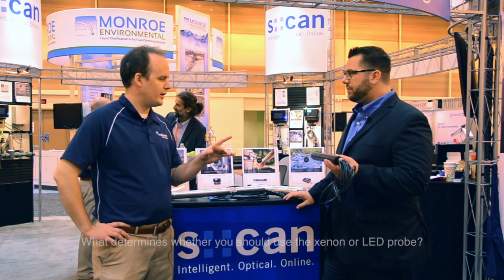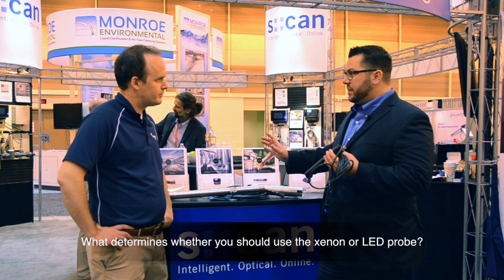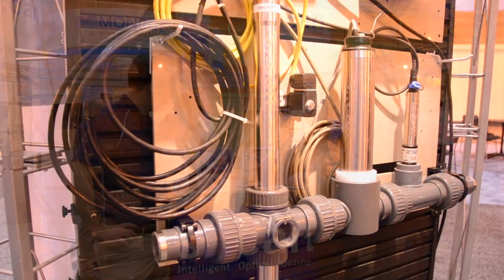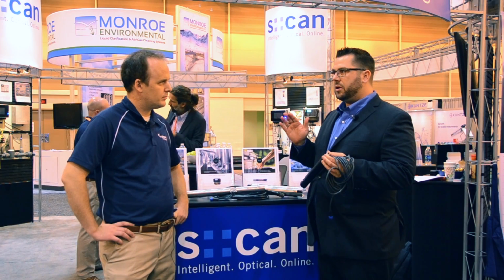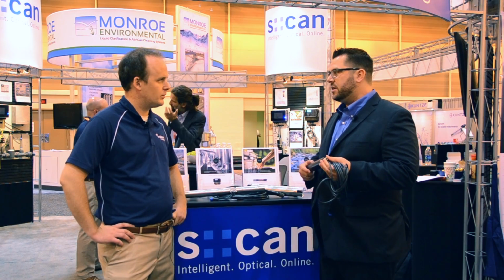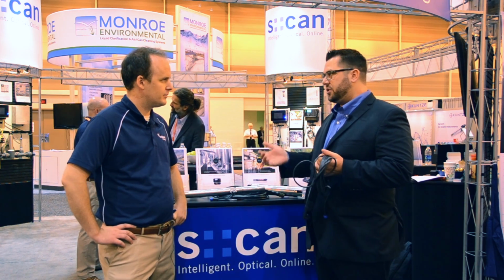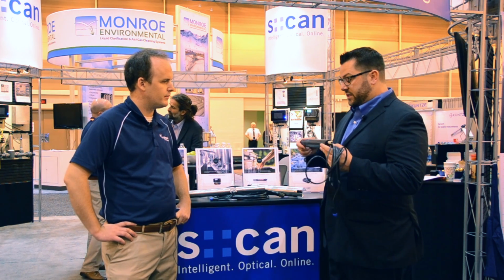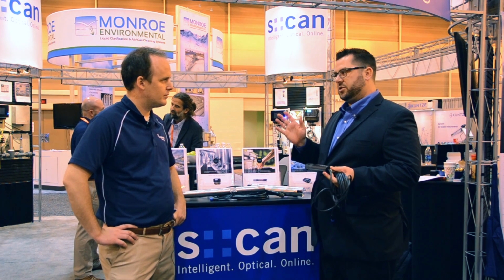So why would we use this probe versus that probe? Where do they fit? The difference is the wavelengths that we're actually measuring. Because this is using a xenon flash lamp, we can go down to 190 nanometers. LED light sources only go down to about 250 nanometers, which eliminates a nitrate or nitrite measurement. To measure nitrate and nitrite, you need to get down to about 200 and 220, which LEDs just don't go there yet. So this is low cost. Your resolution is going to be a little bit less, but in a lagoon system, it's going to give you the data that you need for COD.